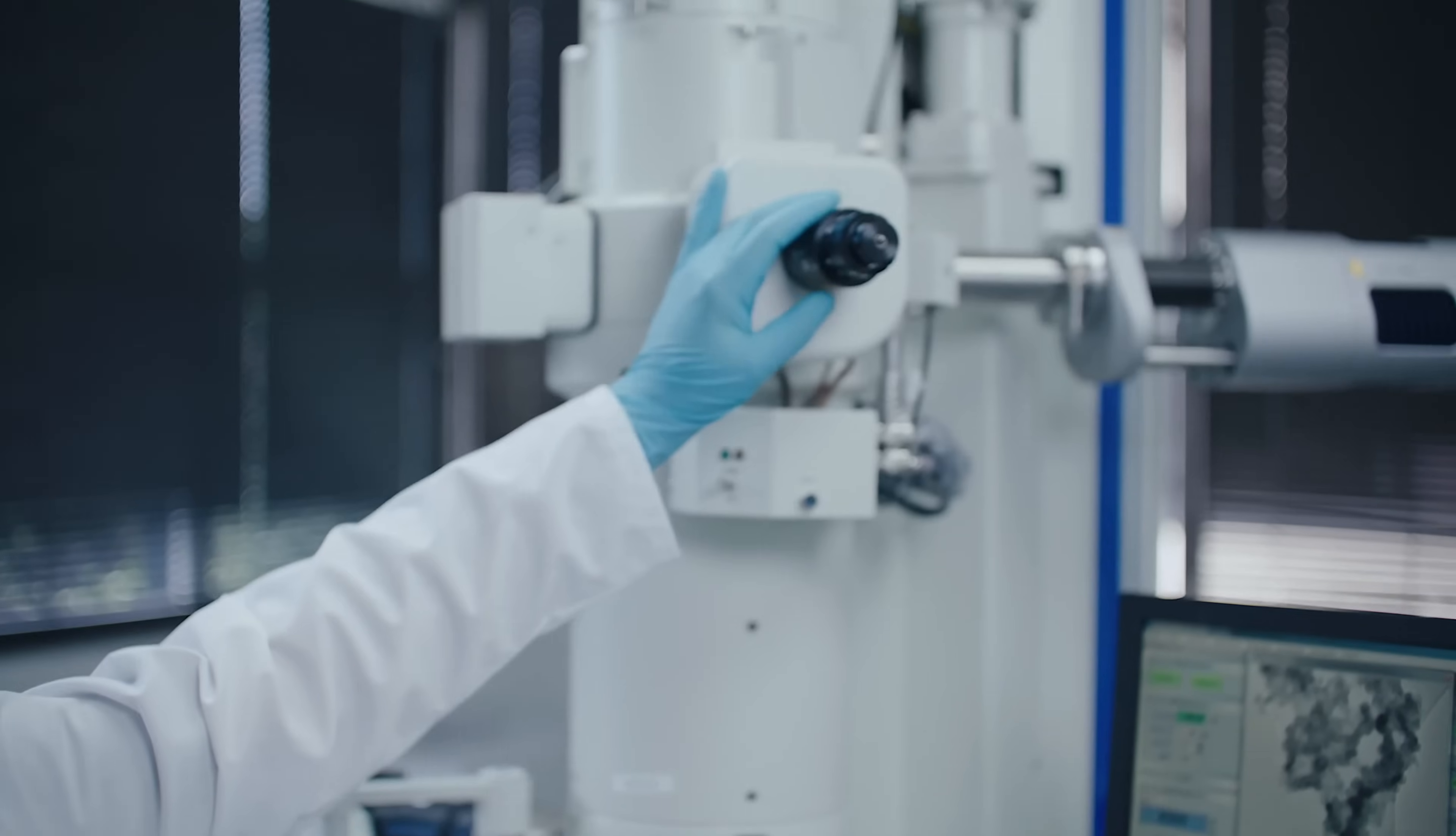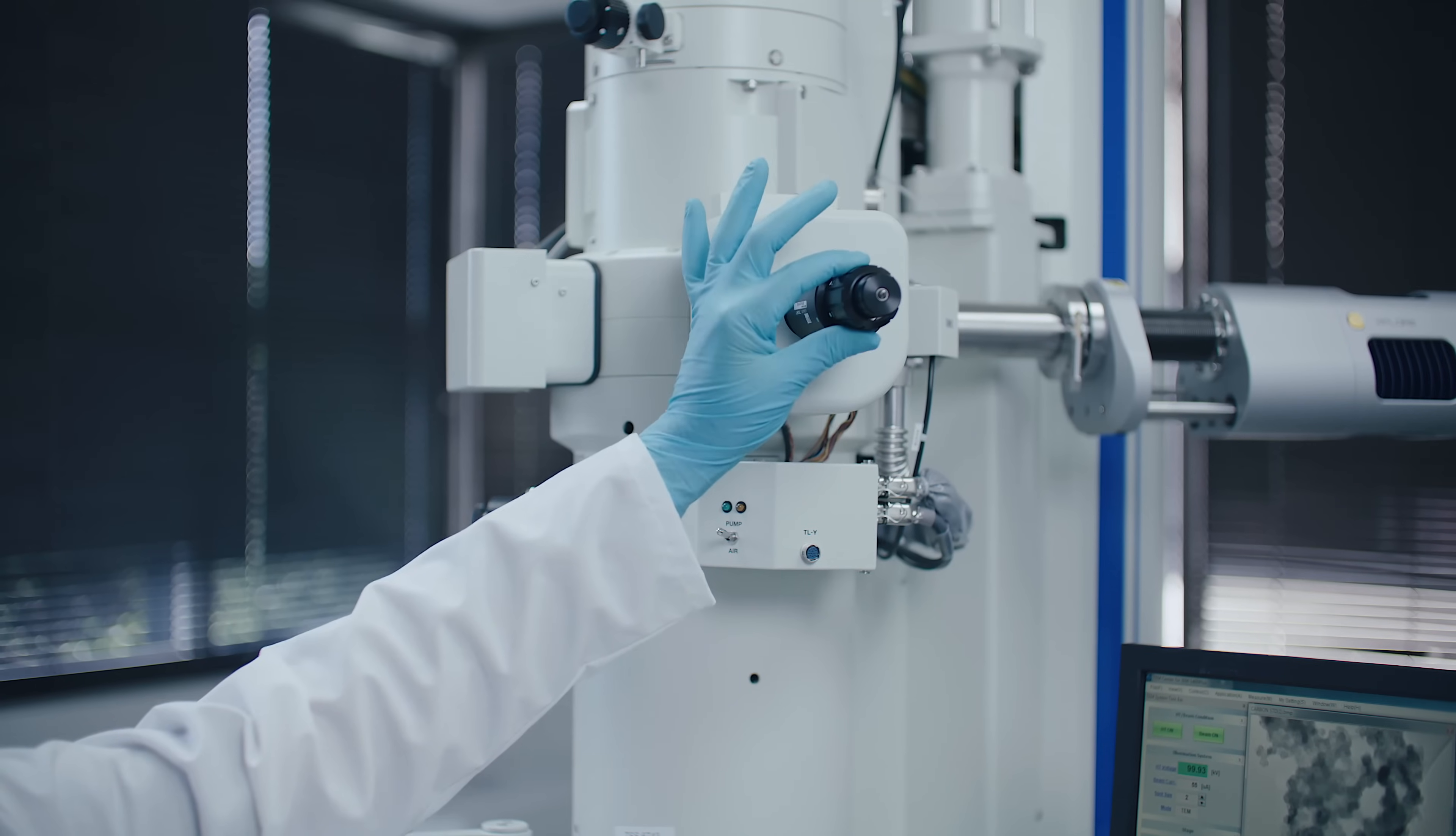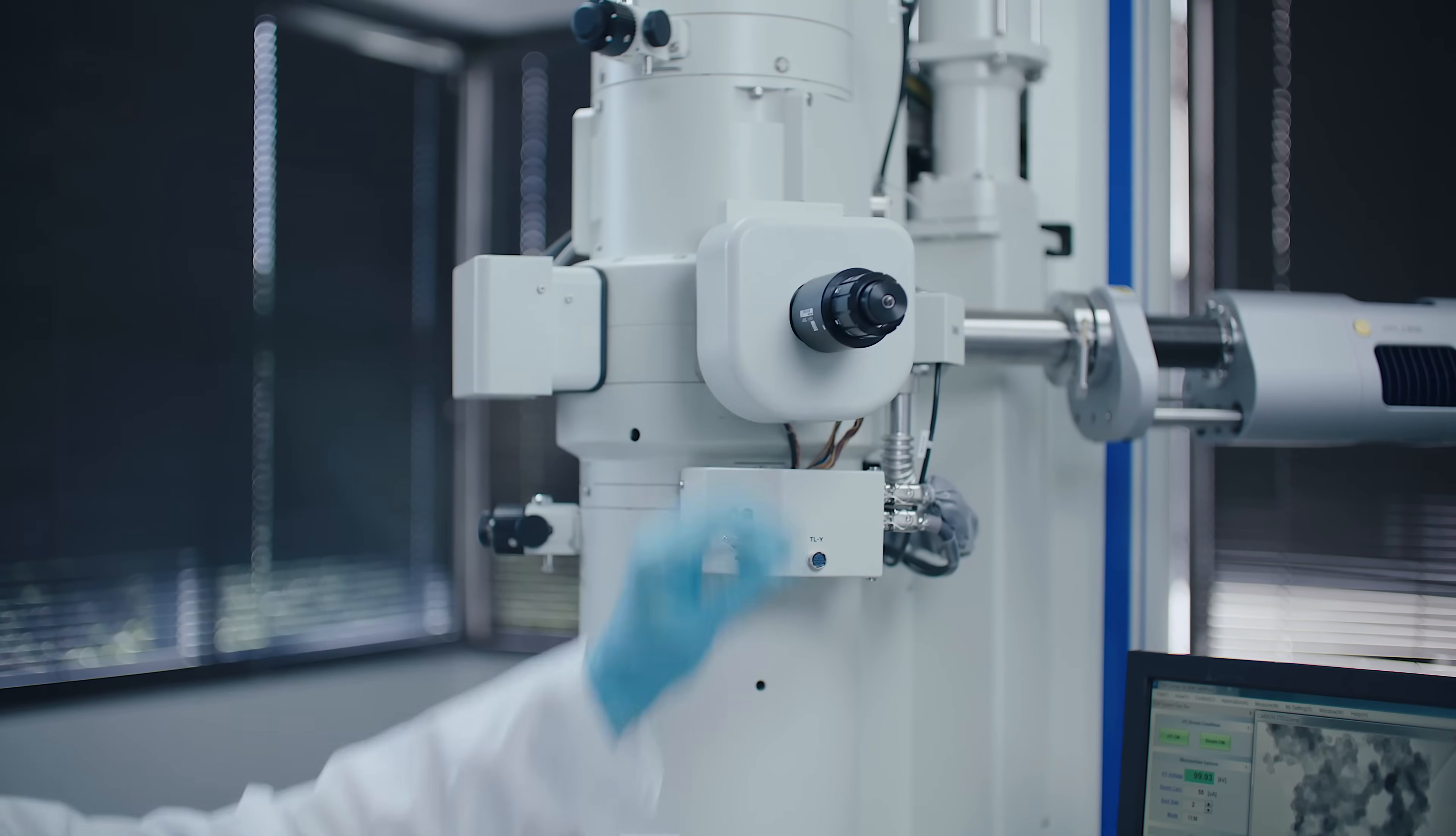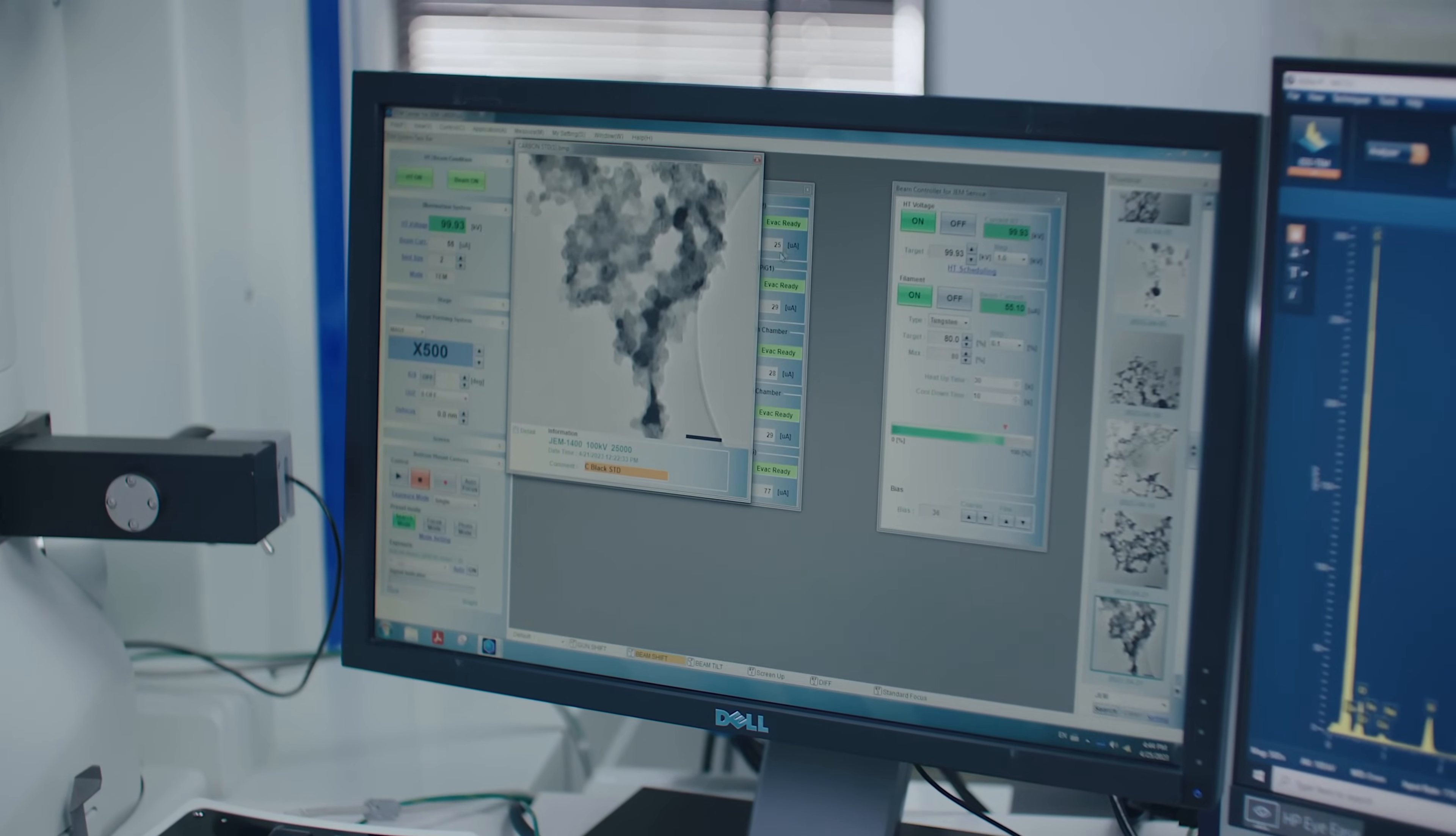So here we have our sample holder. This is our quartet sample holder. It holds four of them together and we can easily rotate between them like so. That is going to be put in through here and then we have to pump down and prep it again.